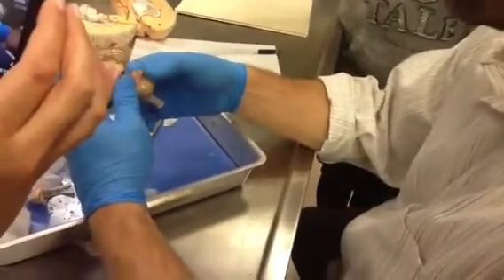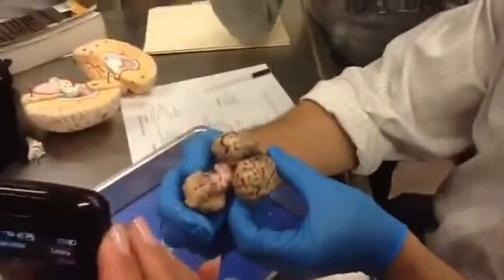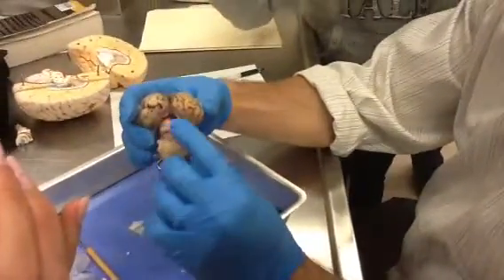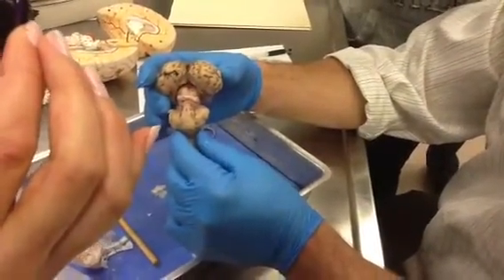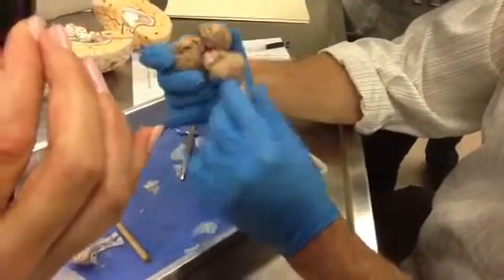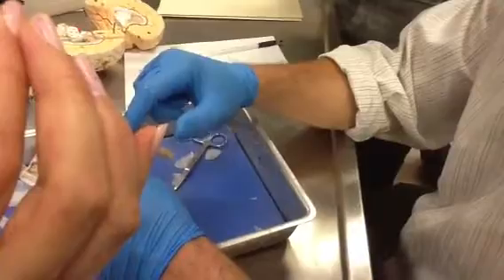Okay, normally when you pull this back, it kind of looks like somebody mooning you. The butt right there. So those 4 bumps that you see right there, the 2 big ones, the butt, and then the 2 underneath it, that's the corpora quadrigemina. That's the back of the midbrain. Quad for 4. Corpora, 4 bodies. Get that? Good job. Okay, the corpora quadrigemina right back here.